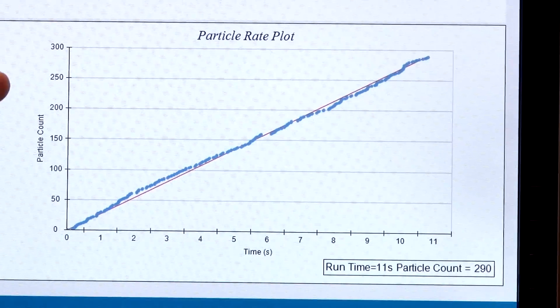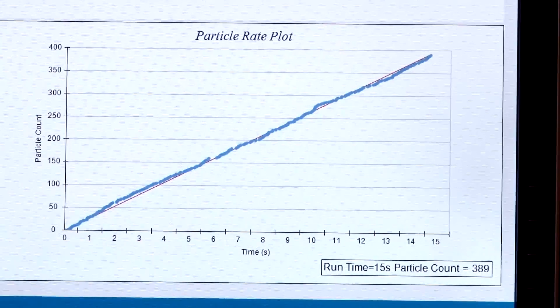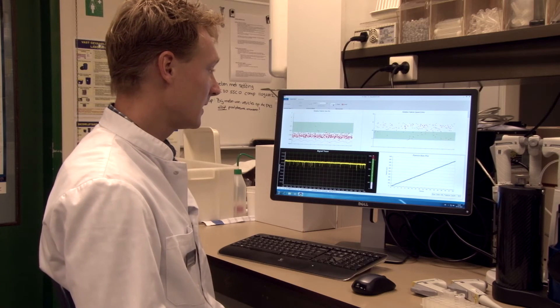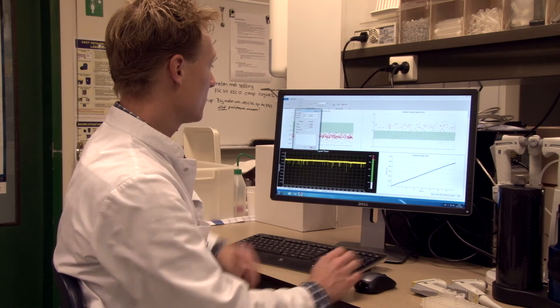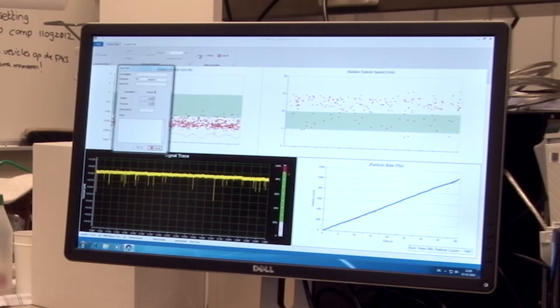On the right, you can see a cumulative particle count versus time, which is expected to be a straight line so you can relate particle count to concentration. Usually we measure 1,000 particles. We have now measured 1,000 particles, so I will stop the measurement and save the data. That's how we perform a reference measurement for resistive pulse sensing.